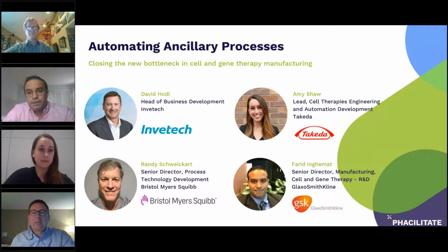Interesting. Randy, your thoughts? Yeah, it is by far the biggest issue that we have to deal with. The uniqueness of the space in cell and gene therapy is that you have unique reagents. These are not your typical throw it in a big vat, mix it together, and there you've got your cell culture media. You typically have very unique activation reagents, transduction systems. These all require unique materials, and these unique materials have to efficiently be incorporated into your core process, and that is a huge challenge.